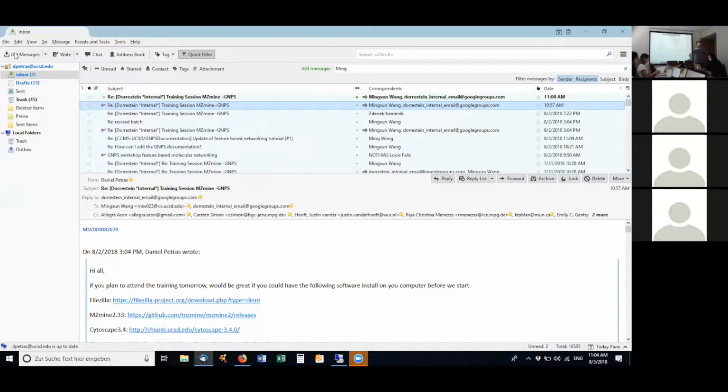Okay. So anyway, right now I only have FileZilla installed here, so I'm going to use it, but you probably want to discover other FTP clients. If you're in Windows, WinSCP is a good one. We can maybe send a link for that later. Okay, so I'm going to log in right now on one of the data analysis computers, which I'm remotely connected to, and then we're just going to start with pulling this MassIVE data set.